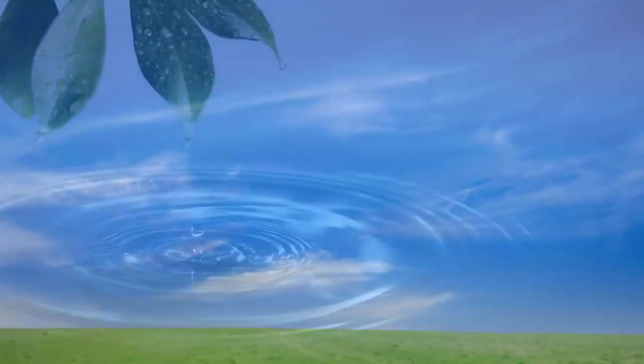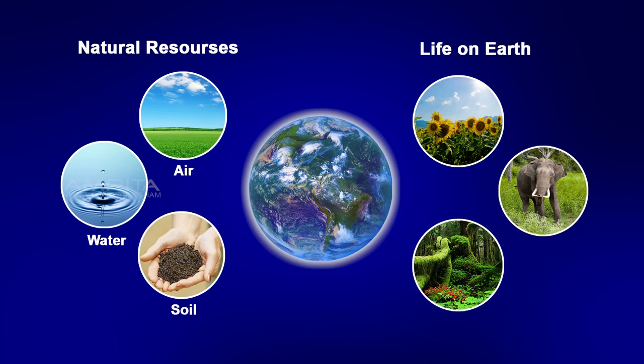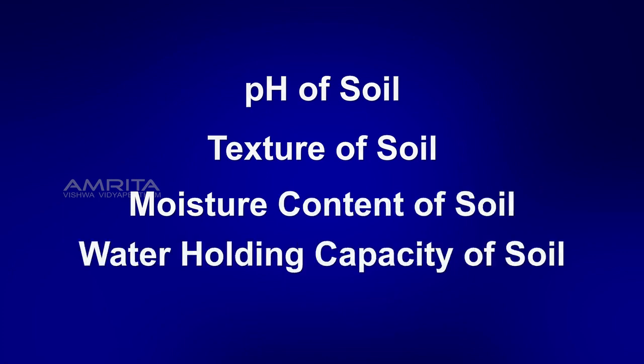Soil, along with air and water, is one of the three most important natural resources, and we cannot live without it. In this video, we will see how to find the pH of soil, texture of soil, moisture content of soil, and water holding capacity of soil.